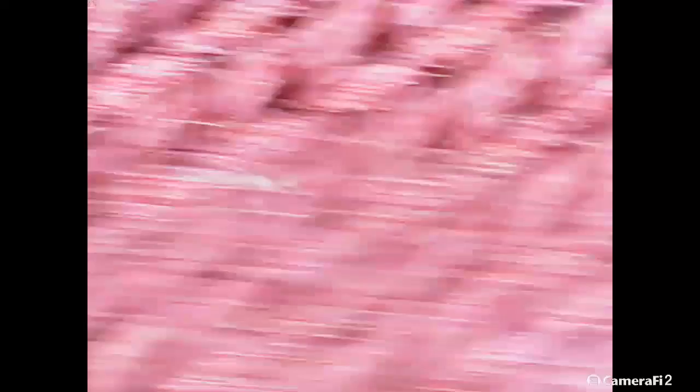The shirt I'm wearing — check that out. Let's see what the zoom button does. Whoa, that really zooms in — that's freaking cool! And it has an adjustment on it. I'll show you back on camera. That's freaking cool — that's on the t-shirt I'm wearing. What about my hand? Oh, yuck — that is freaking — sorry for my language — but that's bloody weird guys.